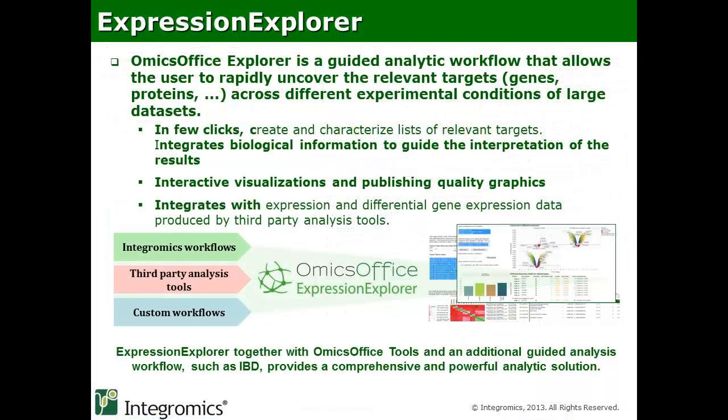Building on this idea of providing the researcher with tools that allow them to easily and efficiently explore their data, we have also developed the ExpressionExplorer. ExpressionExplorer can be used with both expression data analyzed with OmicsOffice workflows, as well as data analyzed with third-party tools.